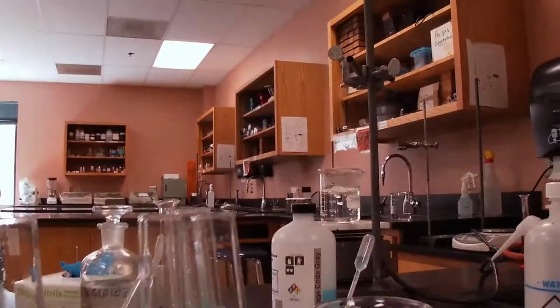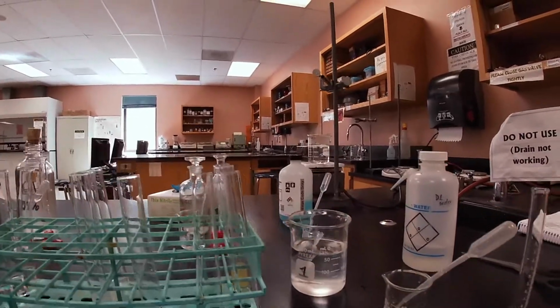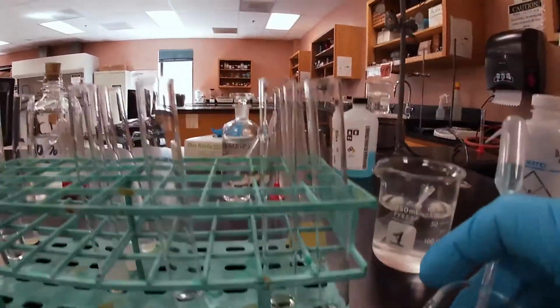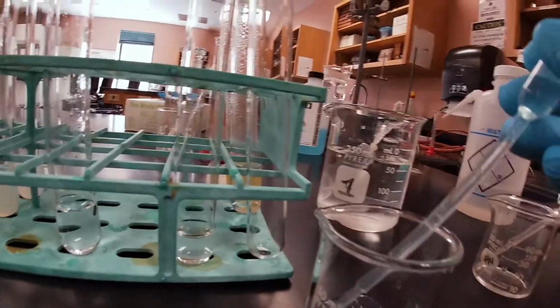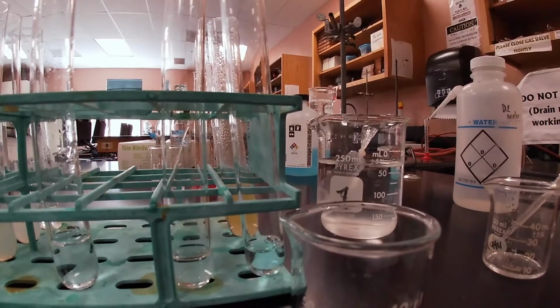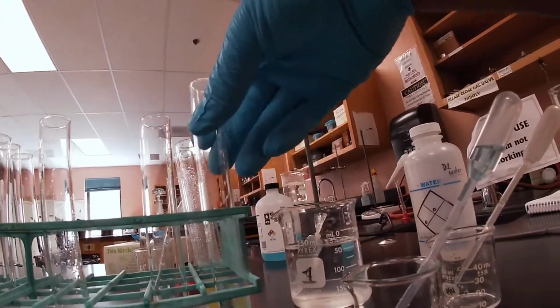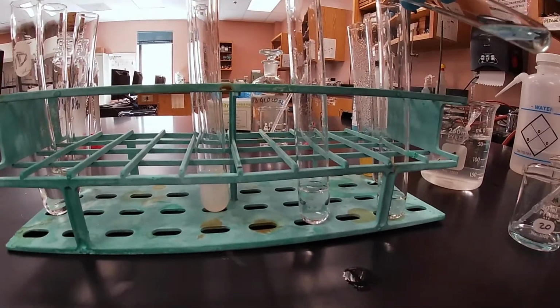I have my boiling water bath over there, and so all I'm gonna do now is add my Benedict solution. So let me go ahead and get it. As I get the Benedict solution, remember we have our test tube already ready. I'm gonna go ahead and add approximately about 3 mLs, right? And we're gonna add it to our test tube with the outside contents of our solution.